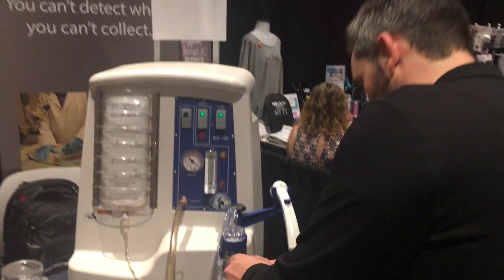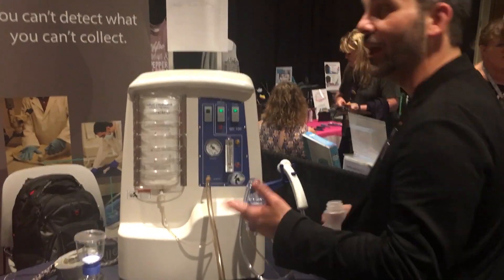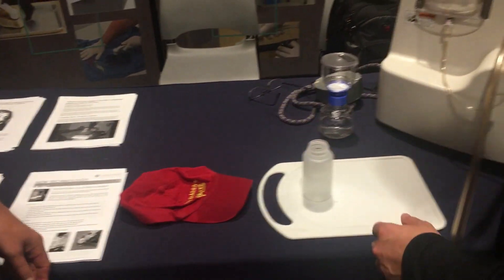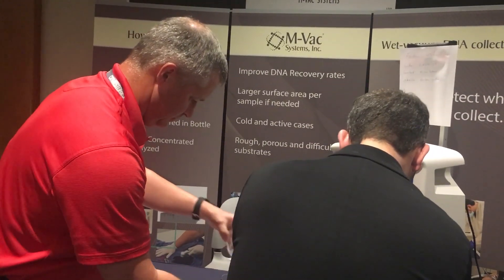You're done. I assume that they should be operating masked up and everything.